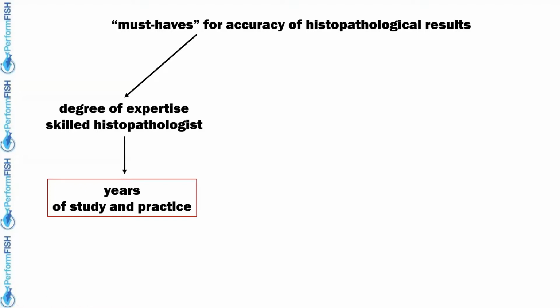Furthermore, to avoid misinterpretation, but most of all misdiagnosis, is indispensable to obtain correct data. Misdiagnosis occurs when a morphological observation is incorrectly considered to be abnormal, or when inaccurate or imprecise terminology is used to describe a particular morphological observation.